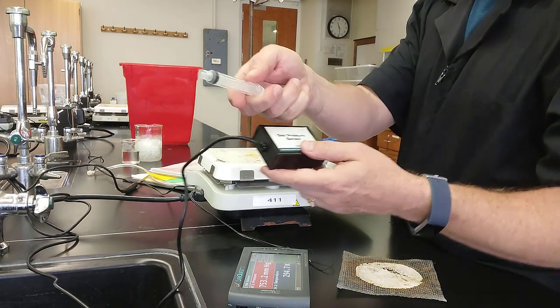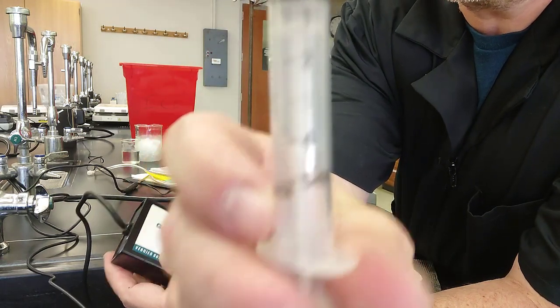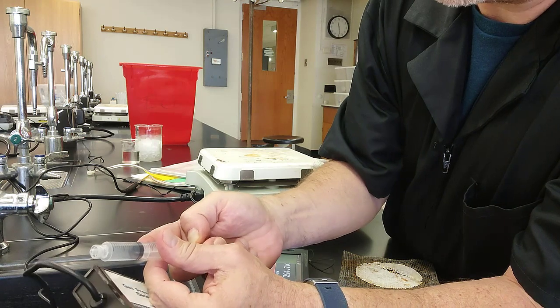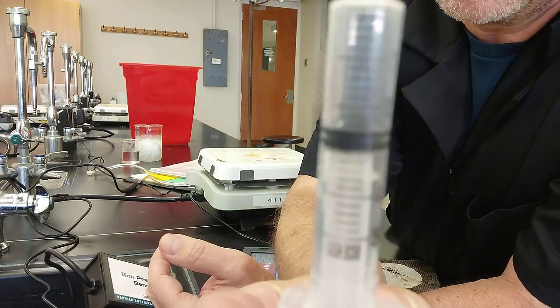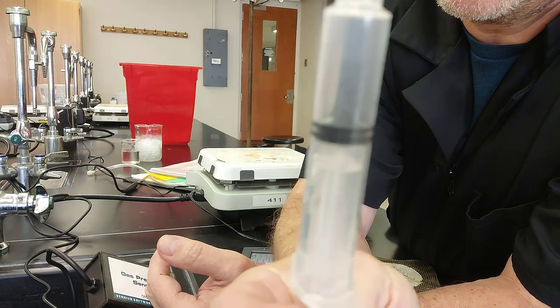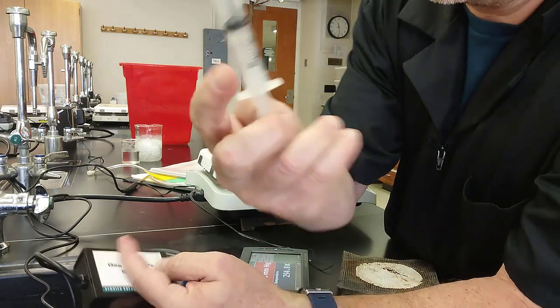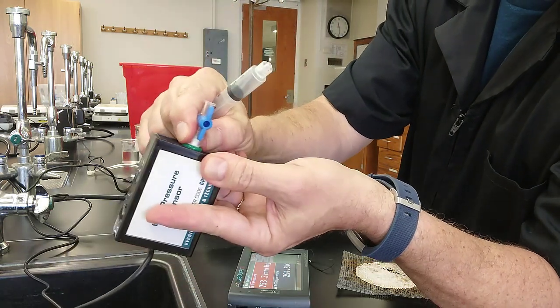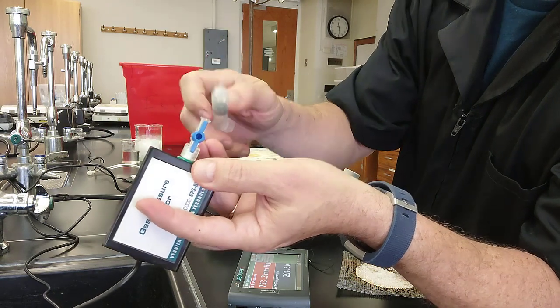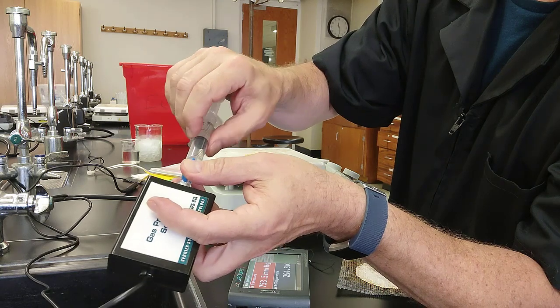the syringe to be half of its volume. This is a 5 milliliter syringe, so we'll set it at right at 2.5 milliliters. 2.5 milliliters. And the pressure sensor is threaded. We'll make sure that it's on there tightly, this adapter. And the syringe is also threaded, so we can just screw it on.